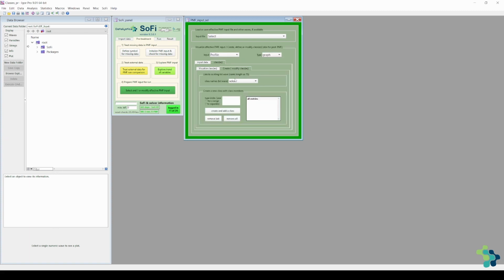Of course, I could create a text wave and assign each variable to either ACSM or exact measurements. But since the variables are grouped instrument-wise, it's much easier to use indices.